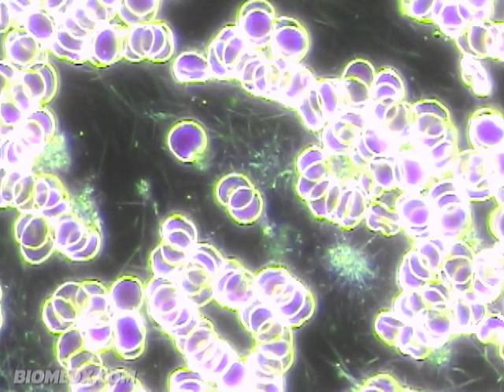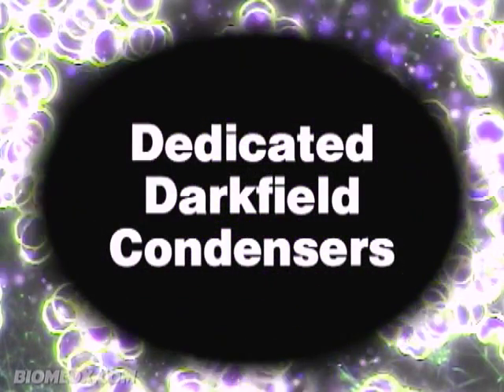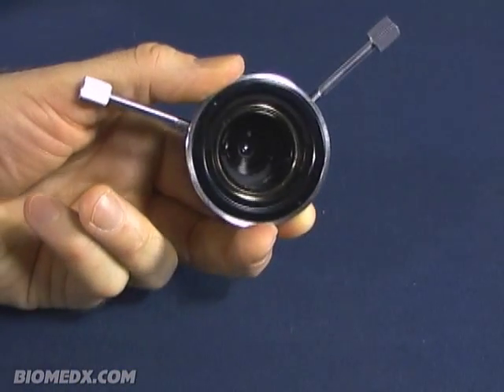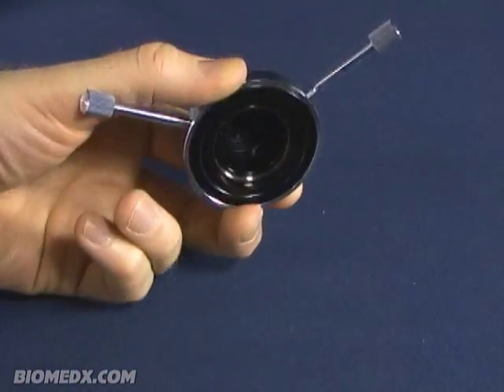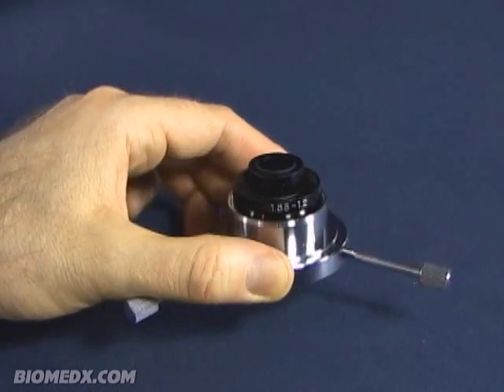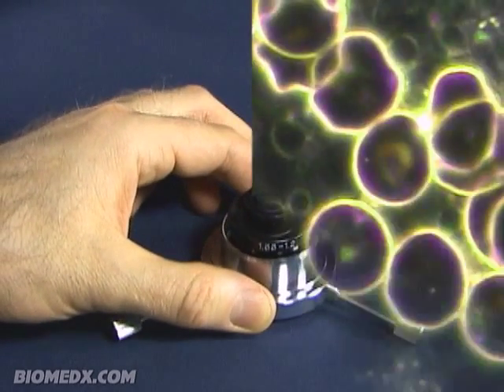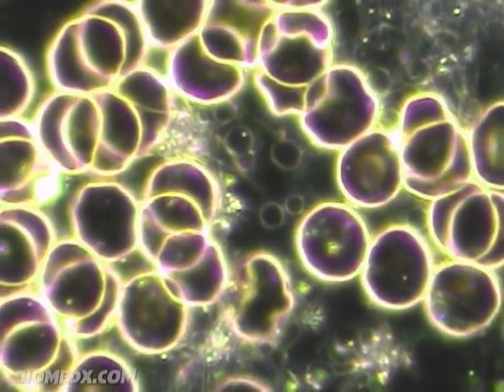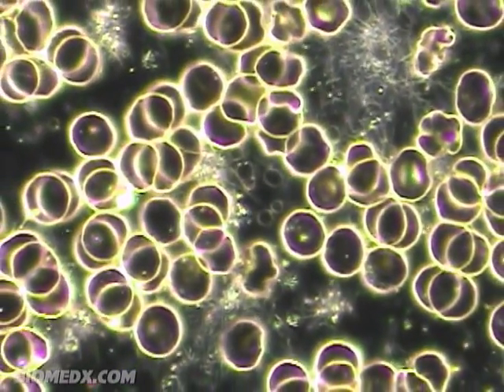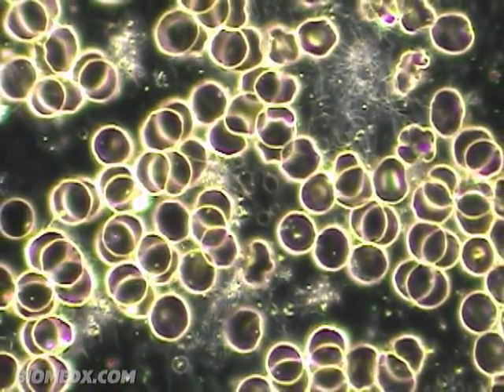When we use a brightfield condenser with a dark field stop, the image is not always as good as it could be compared to using a condenser dedicated solely to dark field viewing. Such condensers are available and we refer to them as dedicated dark field condensers. This is a dedicated dark field condenser — dark field is the only job it does, and it does it quite well. In the first half of the 20th century and earlier, if you wanted to do microscopic investigation of the full dynamics in a sample of living blood, a dark field condenser is what you used.